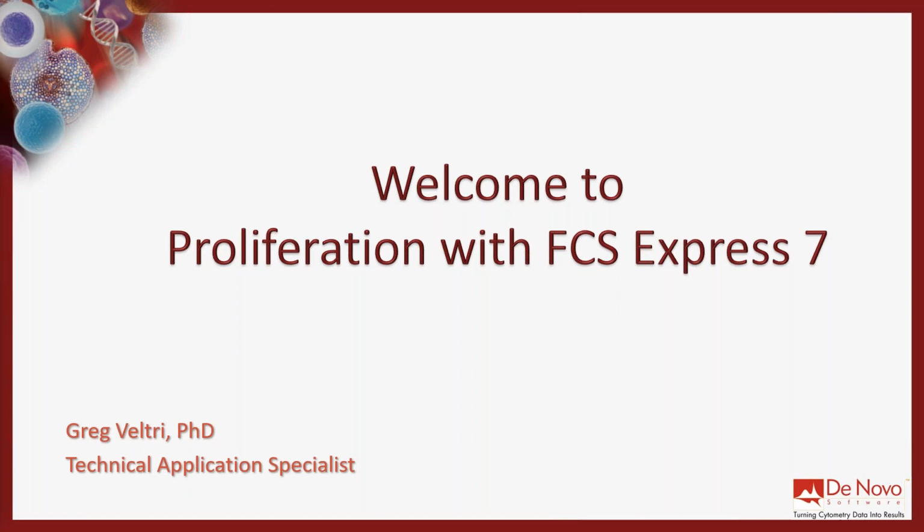We have another one next week on Tuesday, which will be on high dimensional analysis. But today we're going to be talking about proliferation with FCS Express.